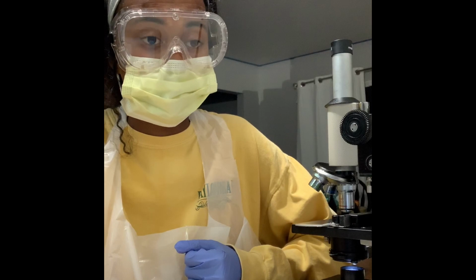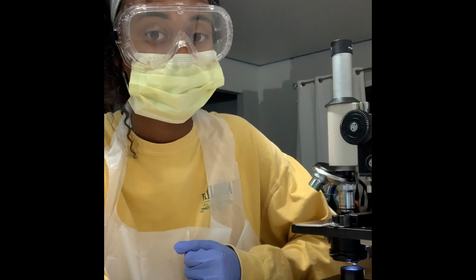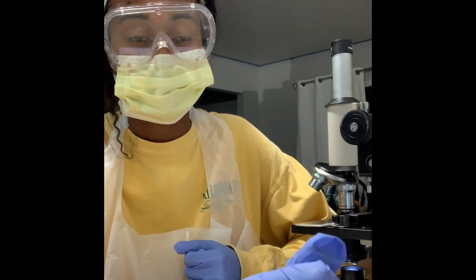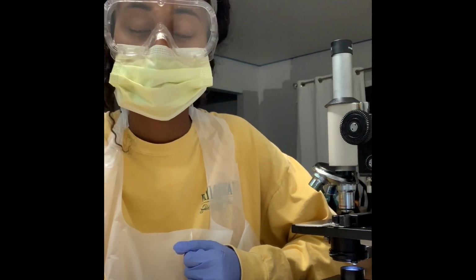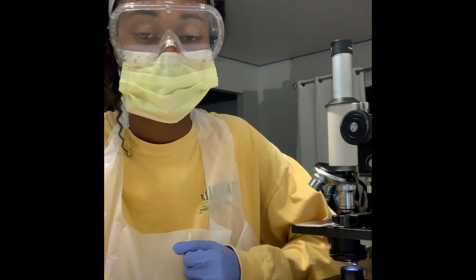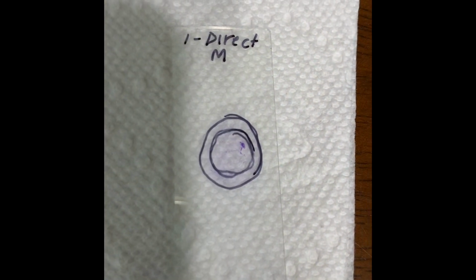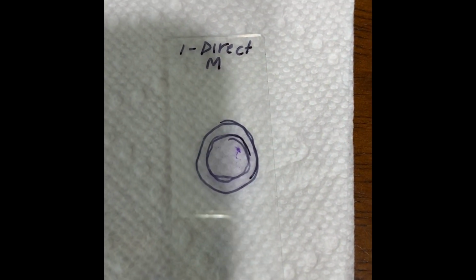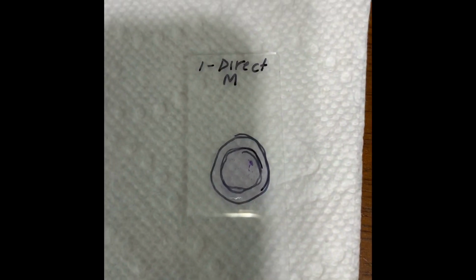After that, I will blot the slide so that only the staining where my mouth swabbed will be left, and then I will look through to see what it looks like under the microscope, under different powers. After rinsing the stain, this is what my slide looks like. There's not much purple from the crystal violet, but I believe that there's enough to be able to see the cells of my mouth swab. So now I'm going to use my microscope to view it with a much higher power.